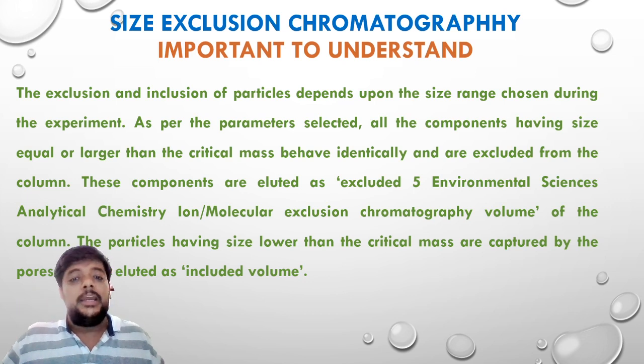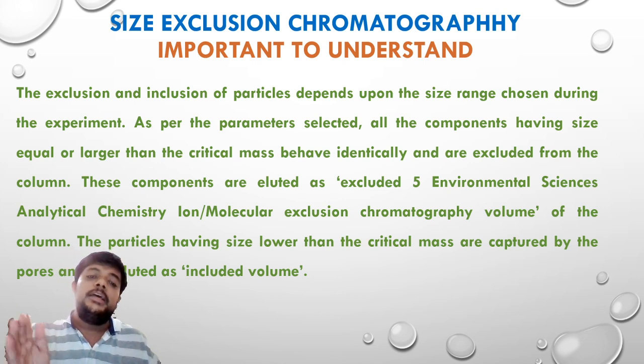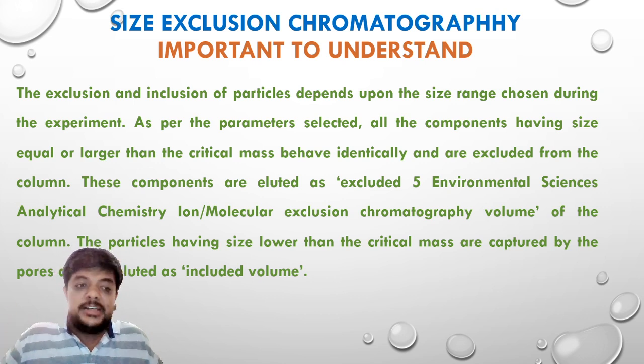These components are eluted as excluded volume of the column. The particles having size lower than the critical mass are captured by pores and are eluted as included volume.